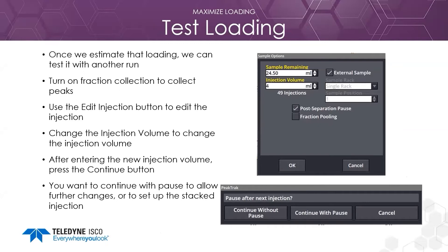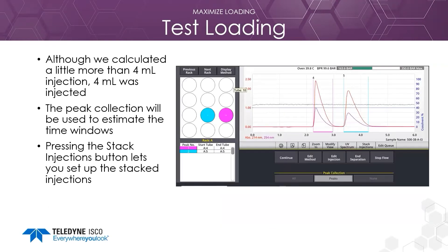Once the loading is estimated, we can test it with another run. I turned on fraction collection in the main screen, and the peak collection times will be used by PeakTrack to set time windows for each peak. I then used the edit button to change the injection volume, entering the new volume and pressing continue with pause so we can set up the stacked injection or make other changes if needed. Four milliliters worked very well — I still have some resolution, but with only 20 mL of sample left, that will be only five injections, so further optimization isn't worth the time and effort.